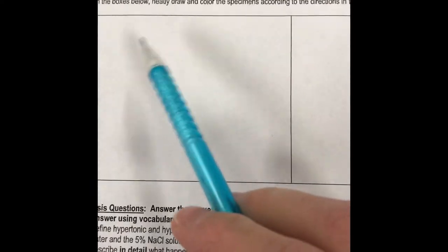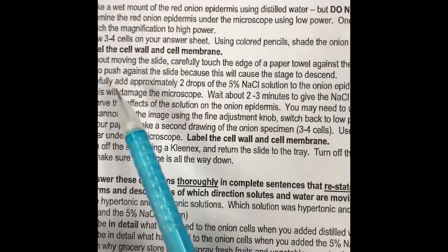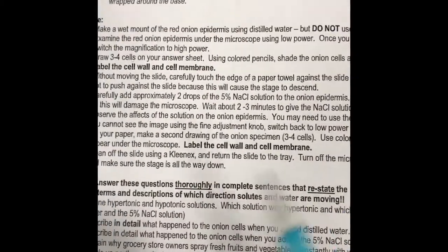This is what you're going to draw. Choose three to four of these cells that are nice and turgid. You might want to pause so you can see the image. Draw your three to four cells off to the left so you can label them. According to the directions, you're going to be labeling cell wall and cell membrane. Make sure to include a title, your total magnification, and shade your drawing the color you see in the video using colored pencils.